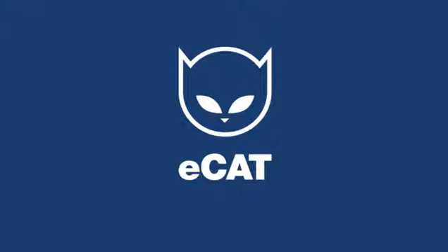Hi, this video tells you how eCAT, a simple but powerful electronic lab notebook designed for biomedical research groups, can help PIs organize the people and the research data in their lab. If you've learned through hard experience that there's far too much research data, your data, data generated by current members of the lab, and historical data to keep track of using paper lab books and unconnected electronic tools, then eCAT could be the right solution for you.